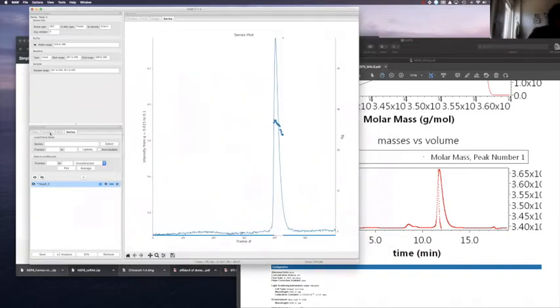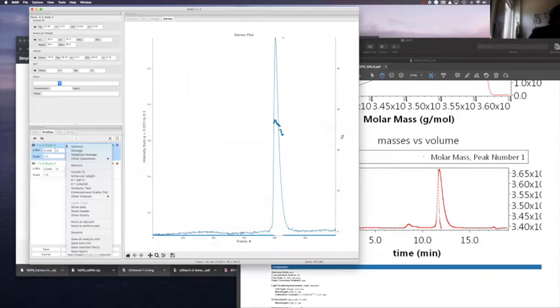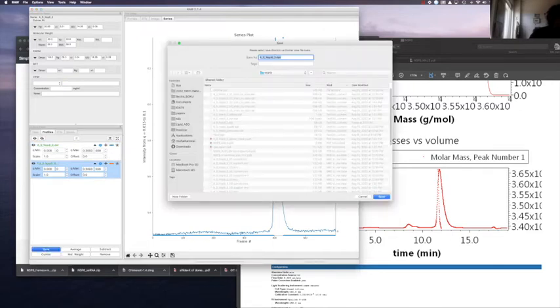And let's go to our profiles, and we need to save those profiles and do some exercise with those scattering profiles. We're going to save those first. Here's the save button. Well, I can put it here, why not? Call it MSP2 data. And this one we're going to say shoulder. Okay.